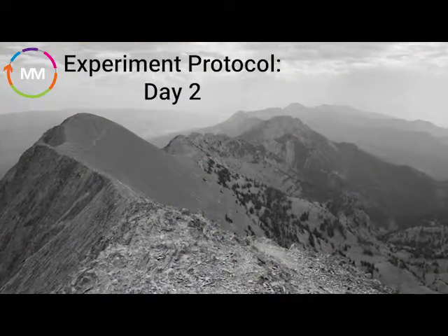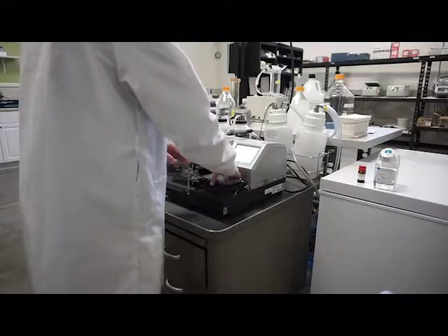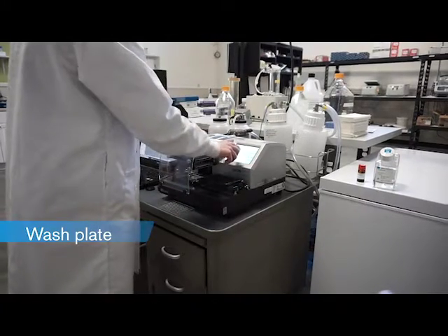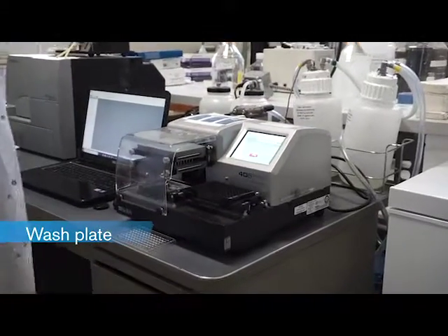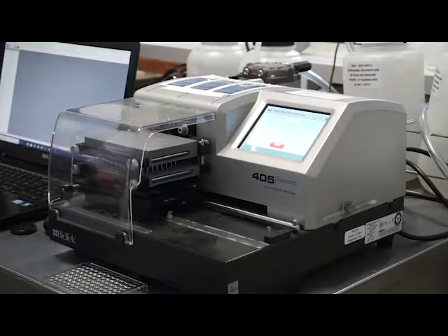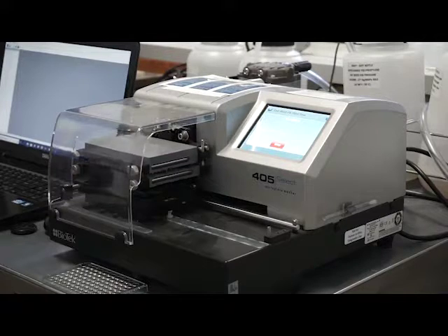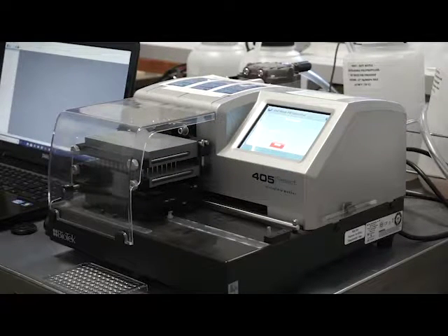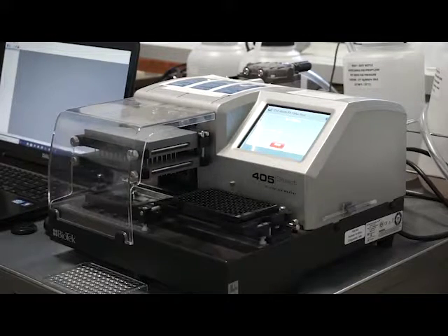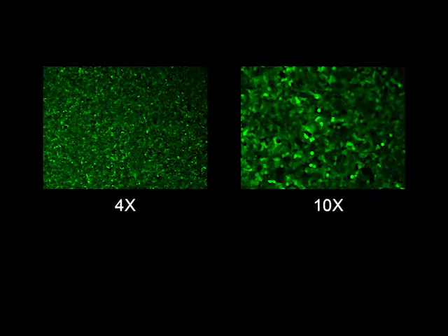Approximately 24 hours post-transduction, we are ready to move to the next phase of the protocol. We begin day two by removing the cell culture media from the plate and adding DPBS. We recommend using an automated microplate washer to perform the media exchange. If this type of instrument is not available, the plate may be washed manually using a multi-channel pipette. However, special care must be taken to assure that the manual washing does not dislodge cells from the surface of the well.